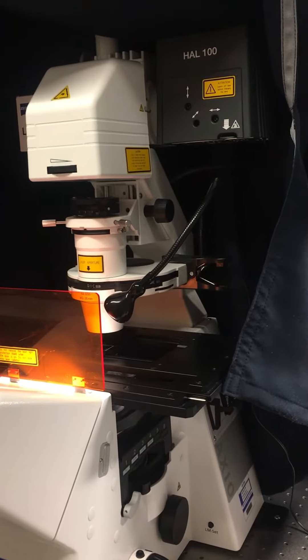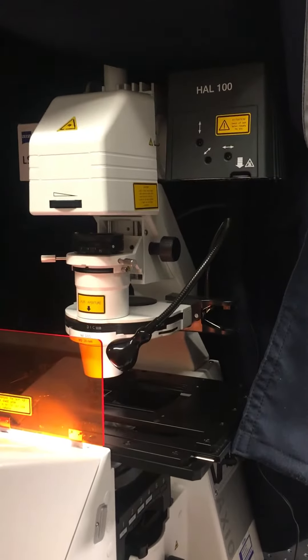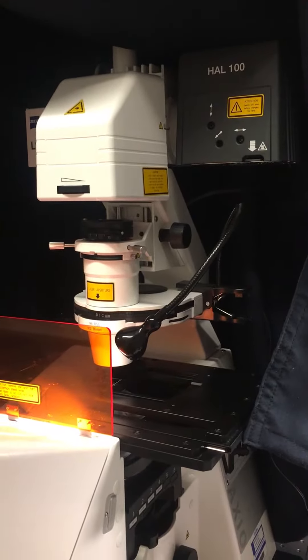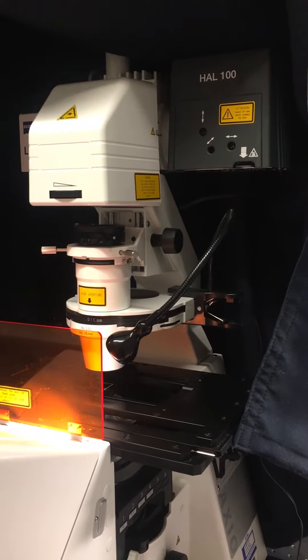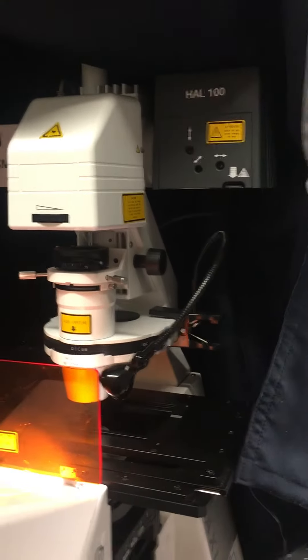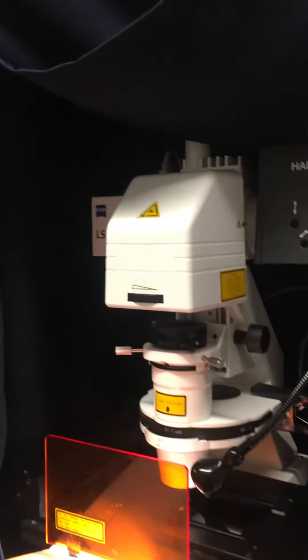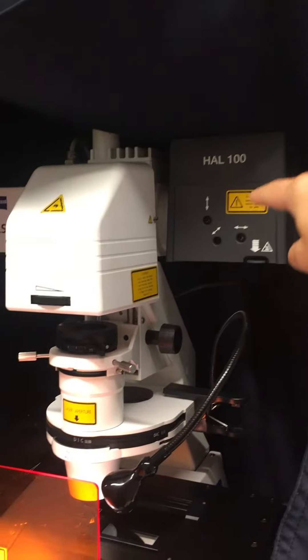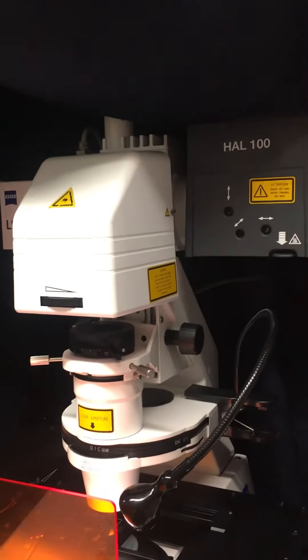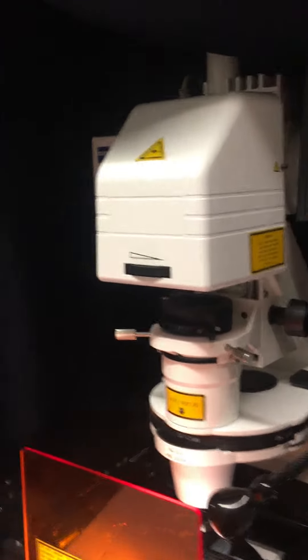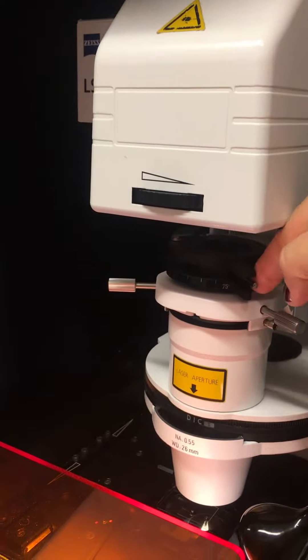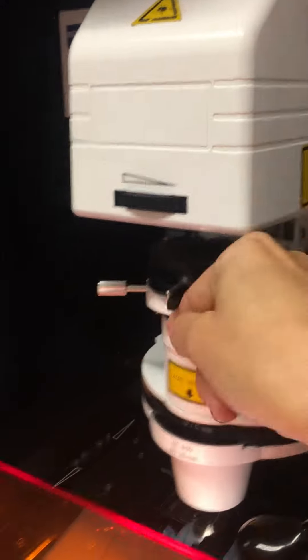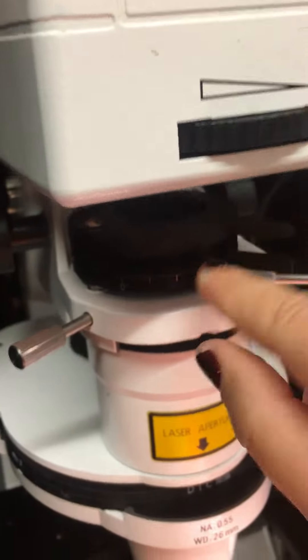To use DIC Differential Interference Contrast or NOMARSKI you're going to need several components. First of all, you'll need a source of light, and in this case it's the halogen lamp. The light should first be polarized, so it goes right here through the filter called the polarizer. You can see it's a darkish glass, and you can change the axis of polarization by moving this handle.